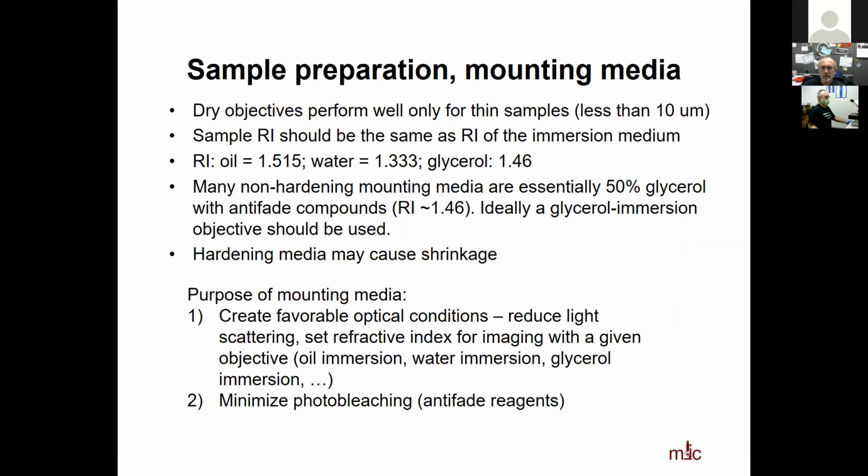Okay, so practically speaking, if you use dry objectives, they worked fairly well, but mostly for thin samples, maybe 10, 20 microns thick. It depends what their numerical aperture is and resolution. The higher the numerical aperture, the more sensitive they will be.